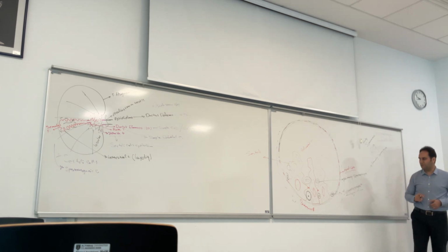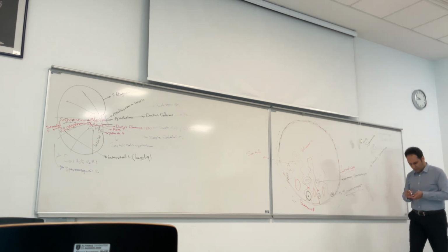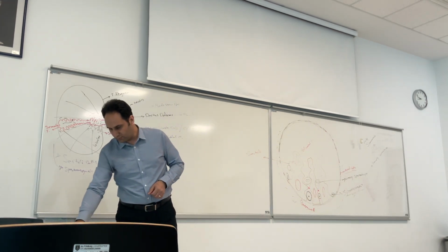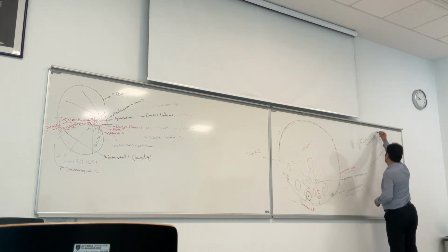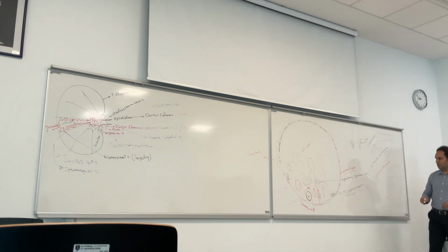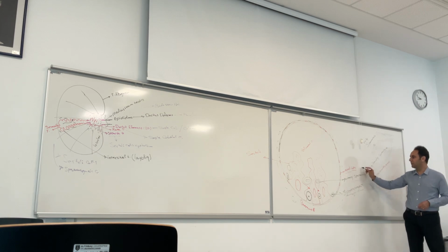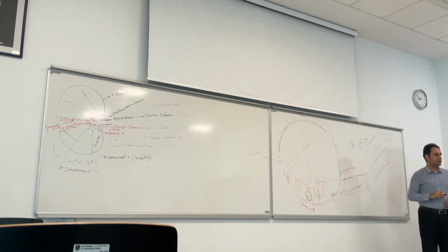At the end of the meiosis division, or the end of the spermatogenesis period, our primary spermatocyte can form four early spermatids.